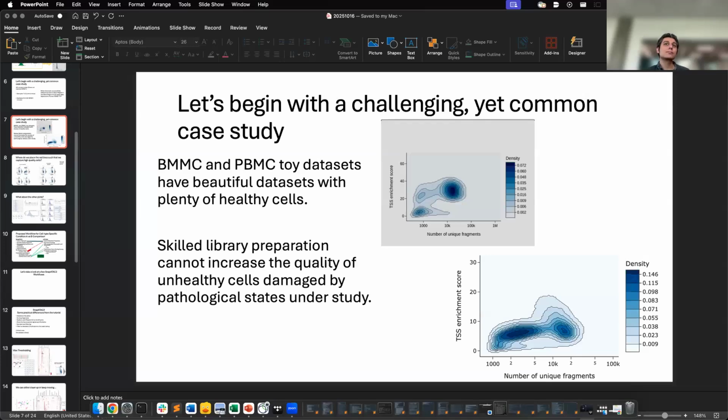And then another basic question. Does a higher binding score mean you're more confident that the binding is happening at that level, or does it mean there's just more interaction at that location? That's my understanding. I'd have to look at the specific source code of the function that calculates that to see how it's calculated. But my understanding is that it's working off the assumption that if the transcription factor is bound, you're going to get this flanked pattern where Tn5 can actually get in there to make the fragments. So it will calculate a score based off of that. It's looking for that pattern essentially, but I don't know exactly how it's calculated.